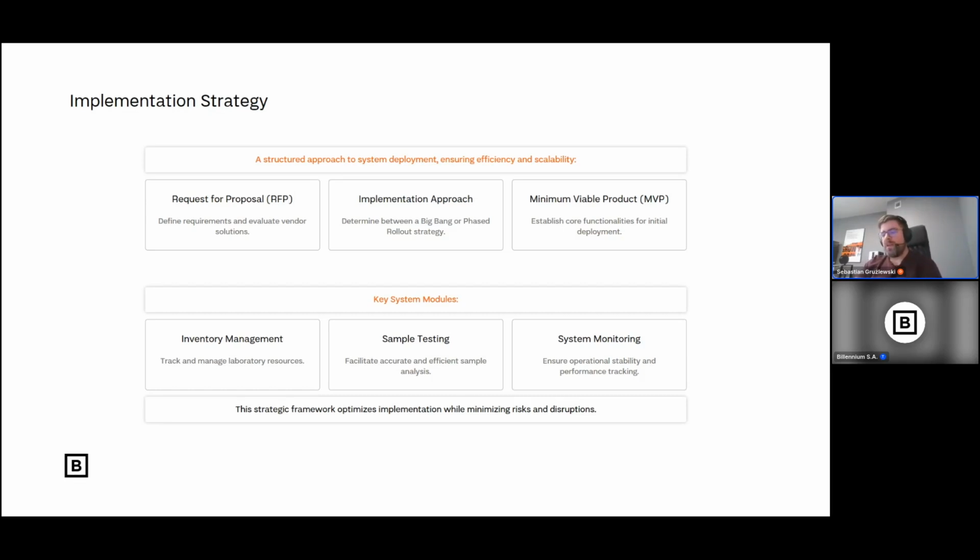The inventory management module is the part of the software that is accountable for creating all your reagents, storing the information about the preparation of your reagents, and doing the same things for your inventory.